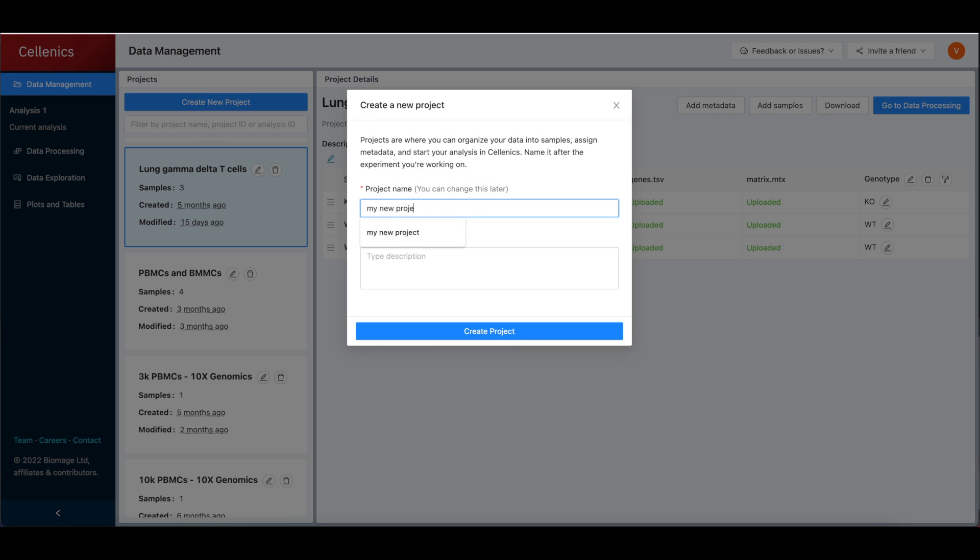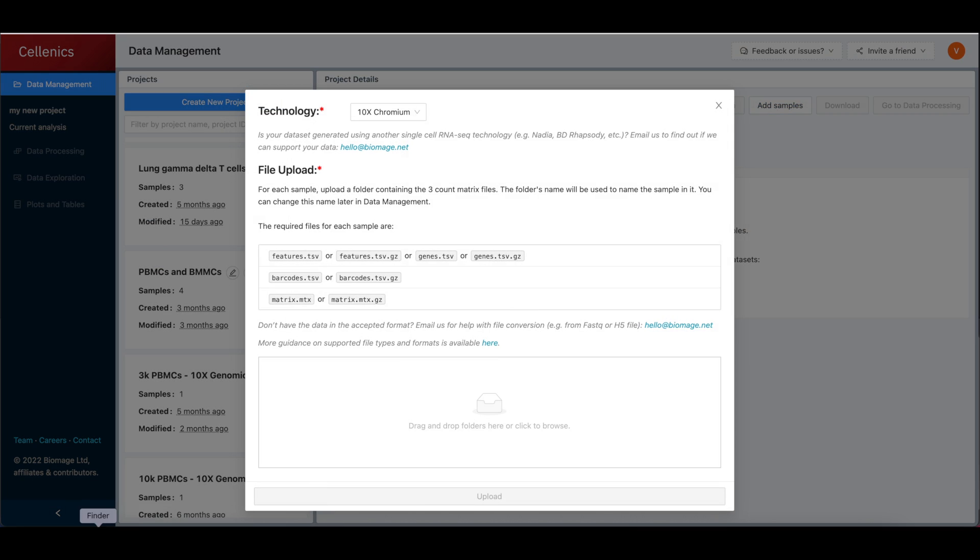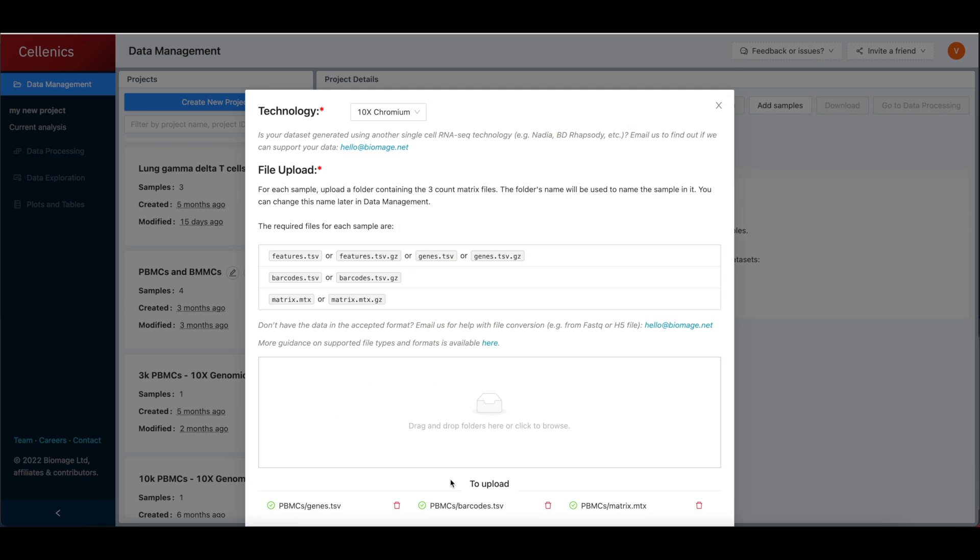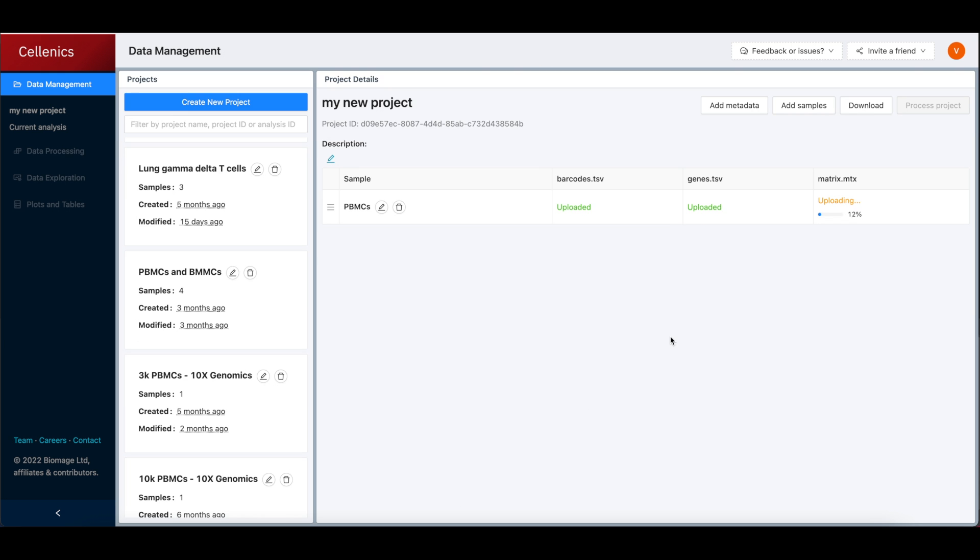In the data management module, users can create a new project and upload sample data and metadata in just a few minutes.